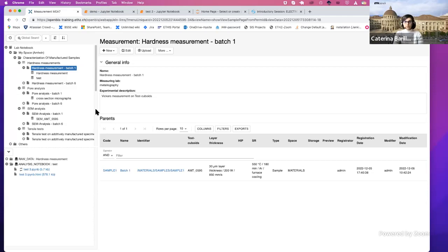Yeah. Thank you. Okay. There's another question in the chat from Dr. Matthias Grönewald. I've seen as menu item export metadata. What is the output? The output is actually a zip file.